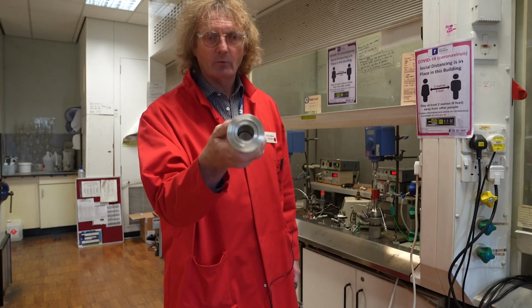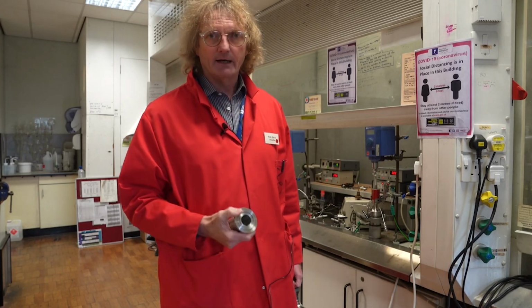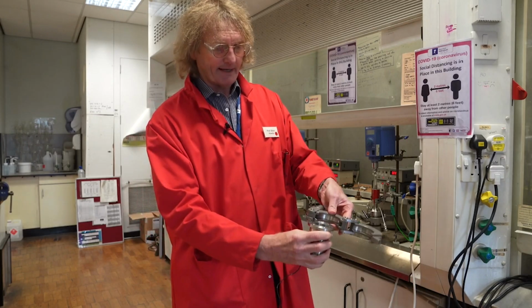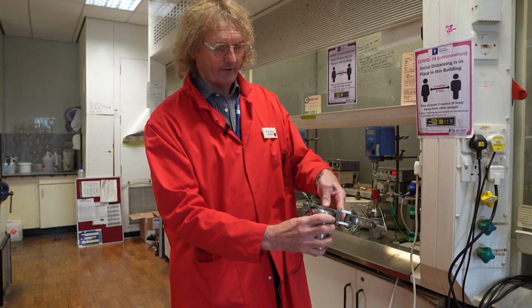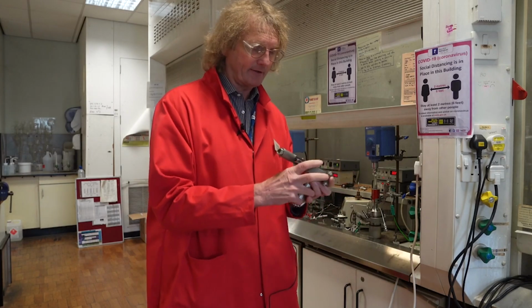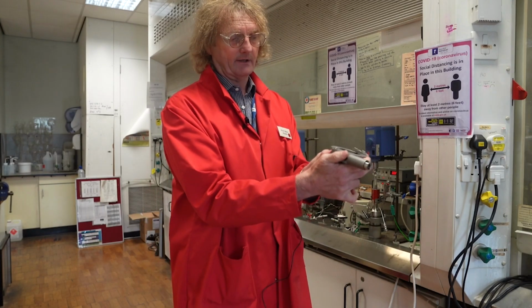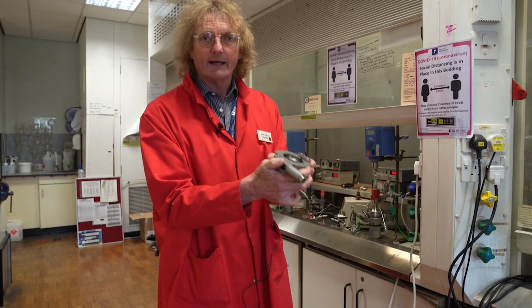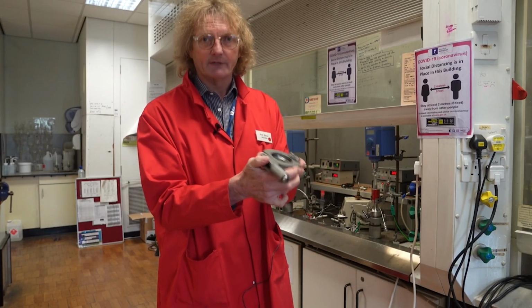And what we do is we add on to that the top unit, and we use a clamp. So here's the clamp, and I'll show you the whole thing assembled in just a moment, but we put the top bit on and we clamp it together, and that's the main sort of part of how we do things, and it allows us to work very safely.